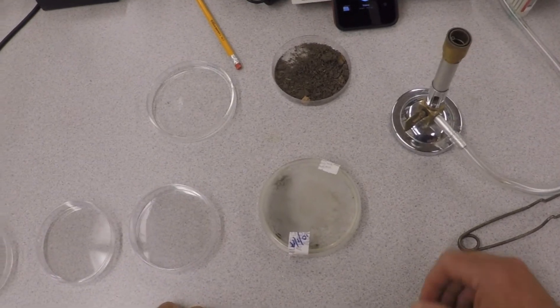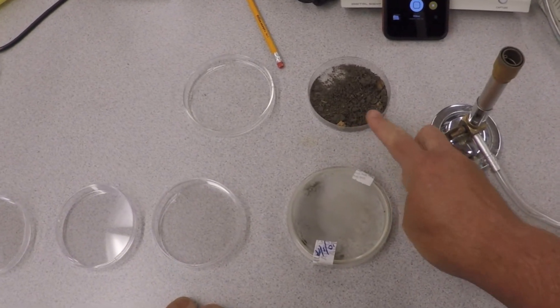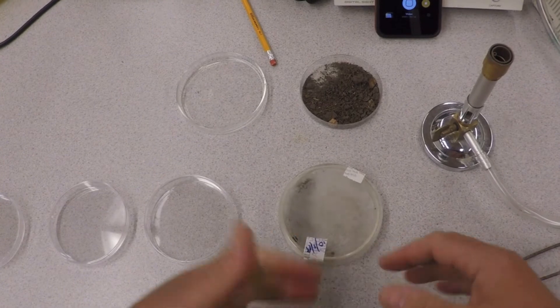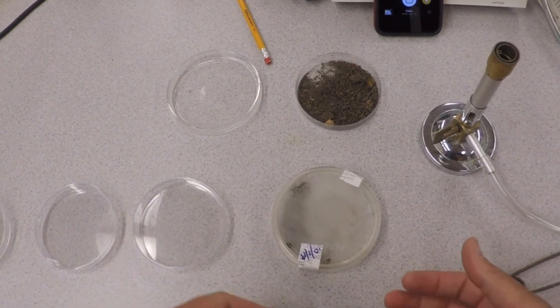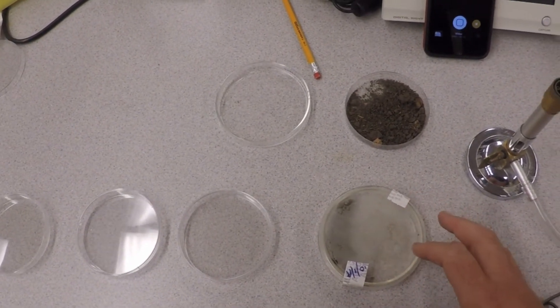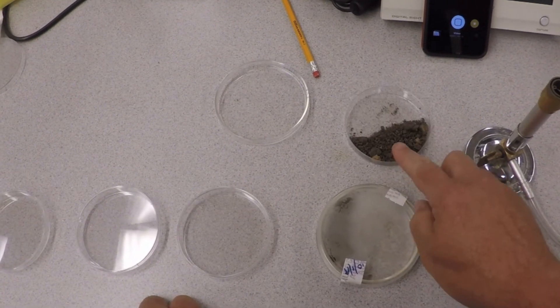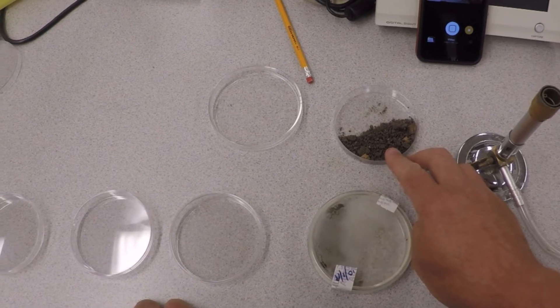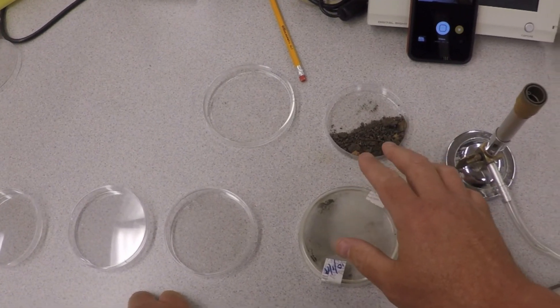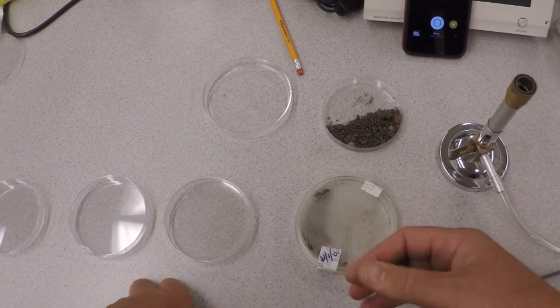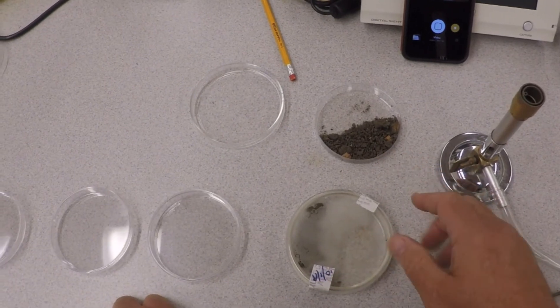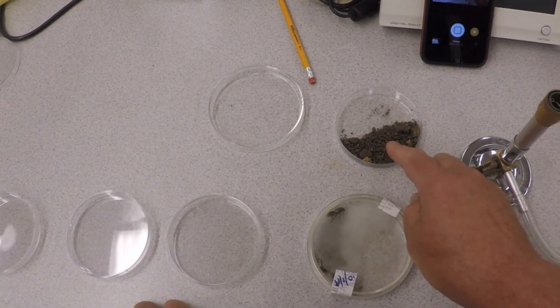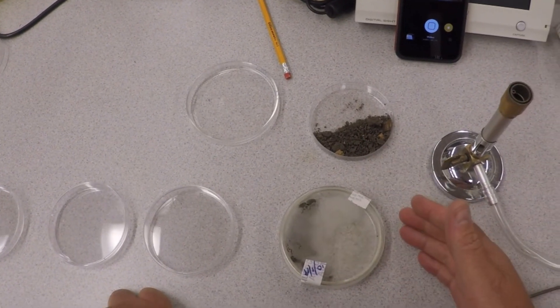Myxobacteria grow in soil. So there's our soil sample. They grow on protein and by eating other bacteria. So what we're going to do is basically hope that there's myxobacteria in this soil from SU. And we're going to bait them. In other words, we're not going to use sugar in the medium. We're not going to use anything specific like that.